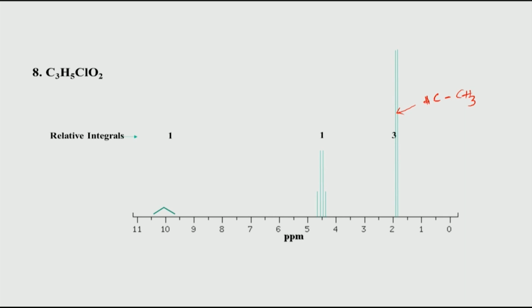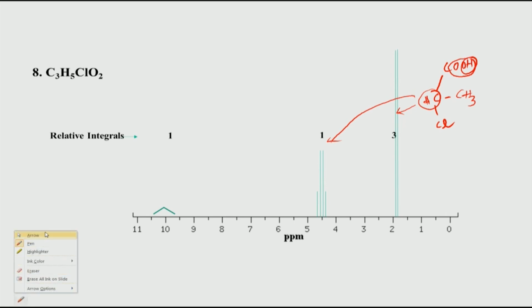This CH is coming downfield shifted, therefore it should be attached to an oxygen or a chlorine, which is what we expect from the molecule. Further, this is probably an acidic group, because only then can you explain the COOH peak coming at 10 ppm. So, let us see whether that is the correct answer.